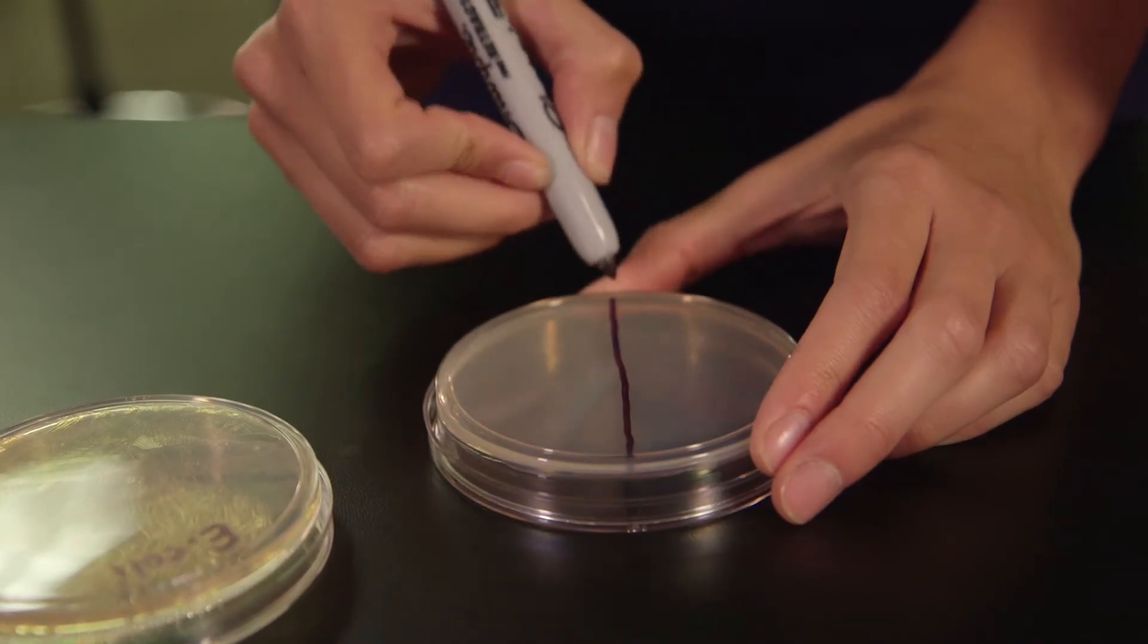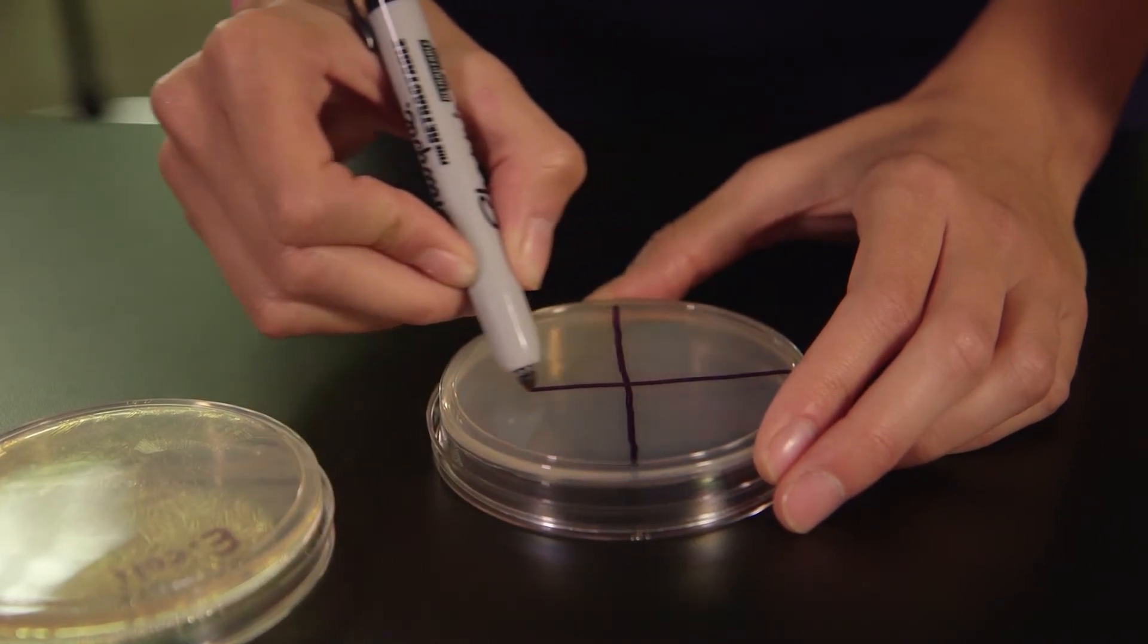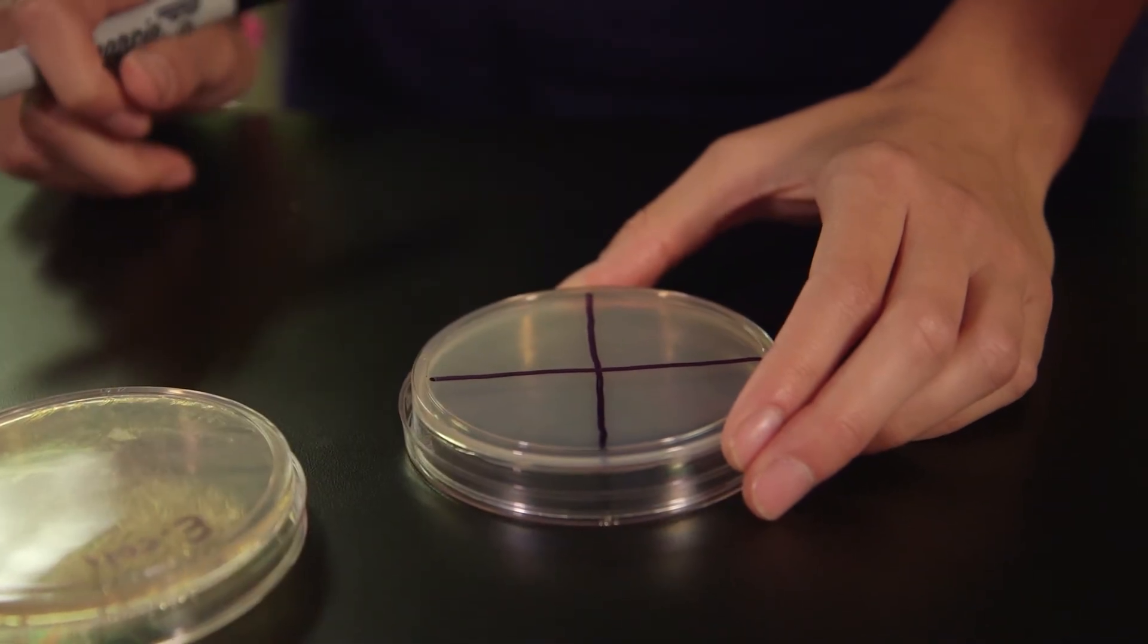Label the outside bottom of the petri dish, the half which contains the agar, with a large X to divide the plate into four quadrants. If you are allergic to any of the antibiotics we are using in this activity, your partner should do the rest of the procedure.